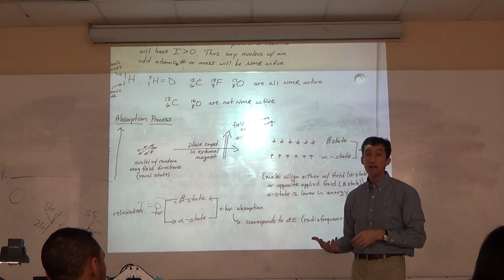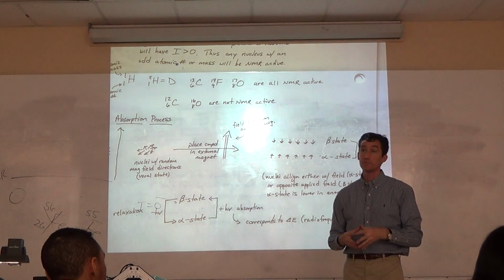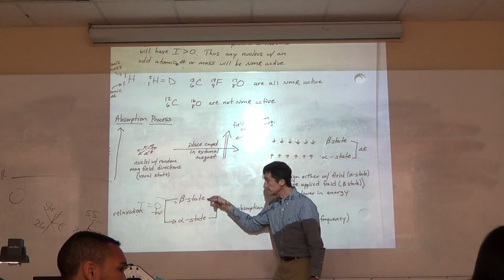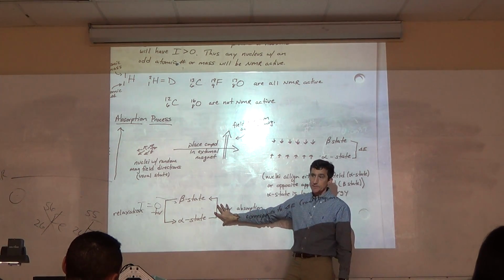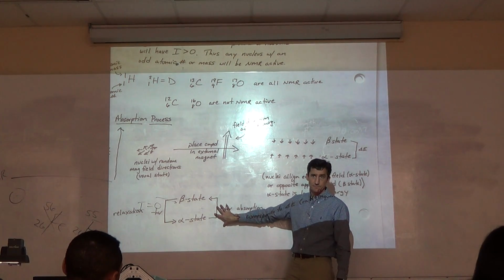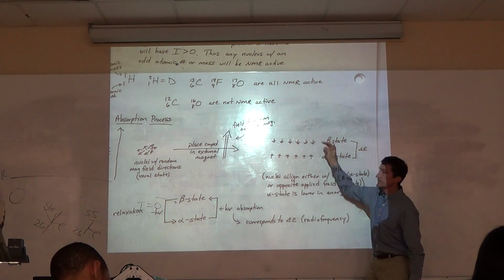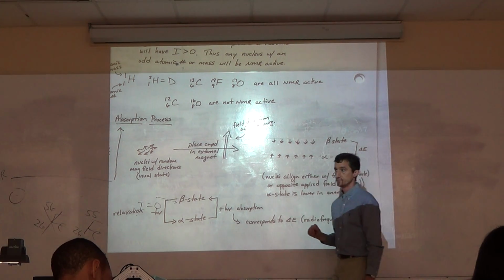Okay? Now, how did I absorb it? It's very physics related. Okay? How does this absorb it? That's a little bit beyond us. But it will, and when it does, those nuclei do a spin flip.